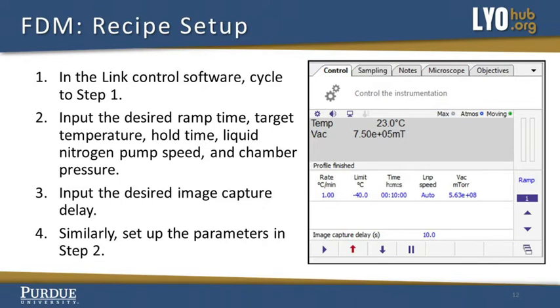Input the desired ramp time, target temperature, hold time, liquid nitrogen pump speed, recommended to leave in auto mode, and chamber pressure.